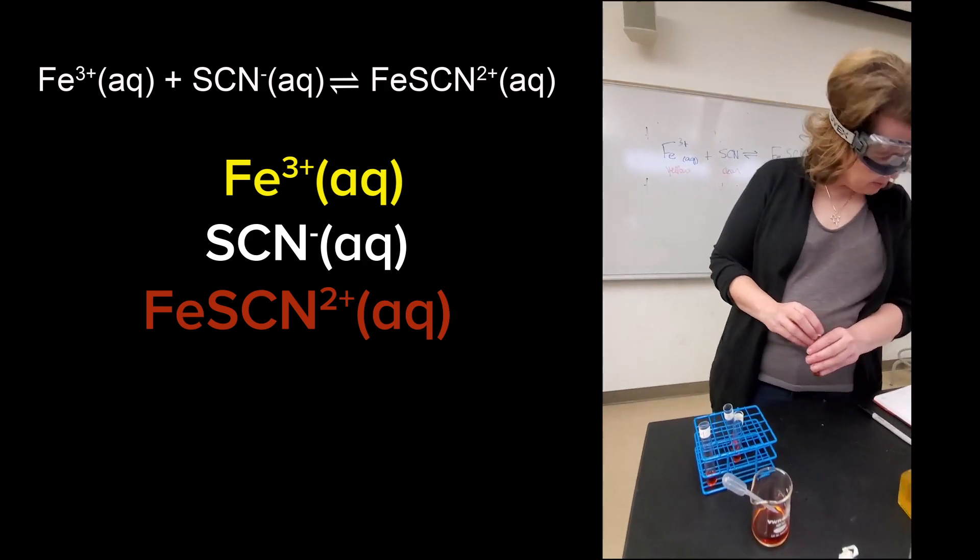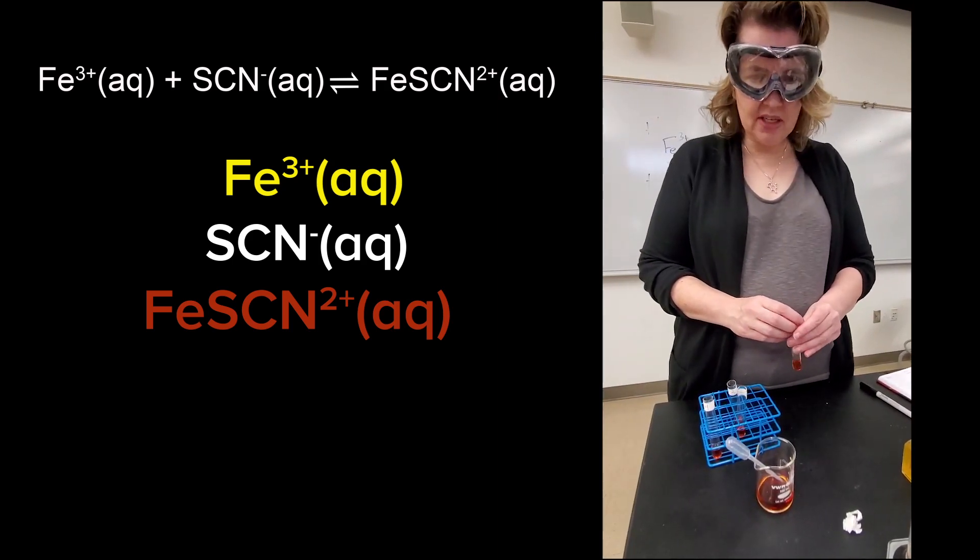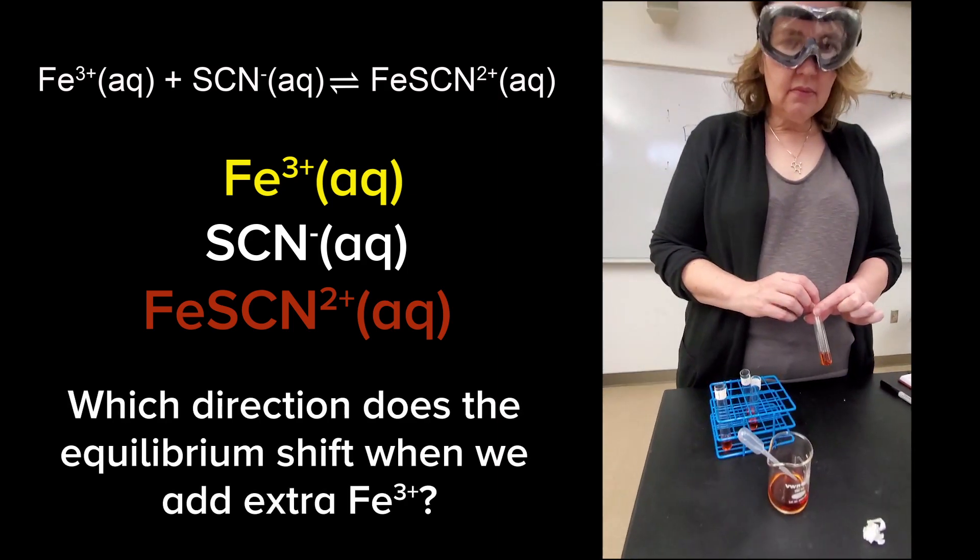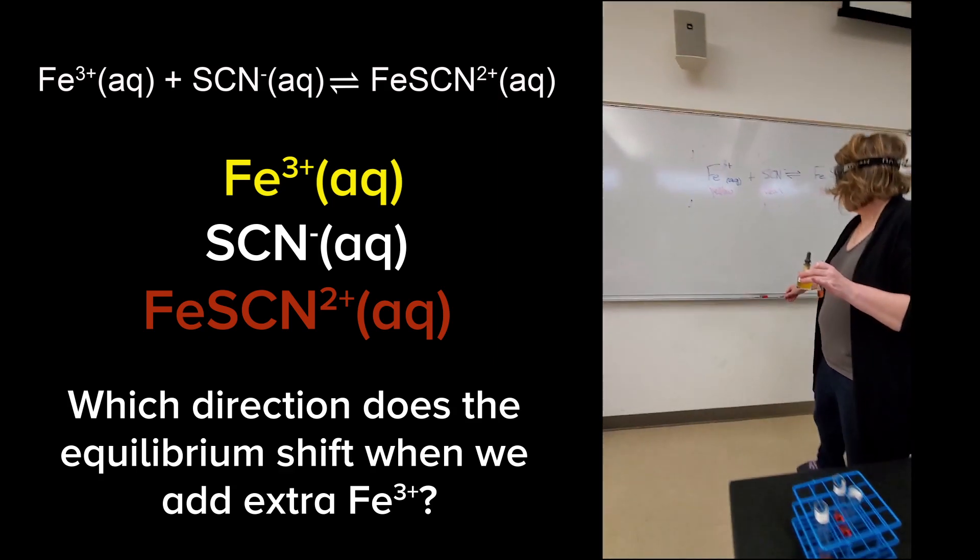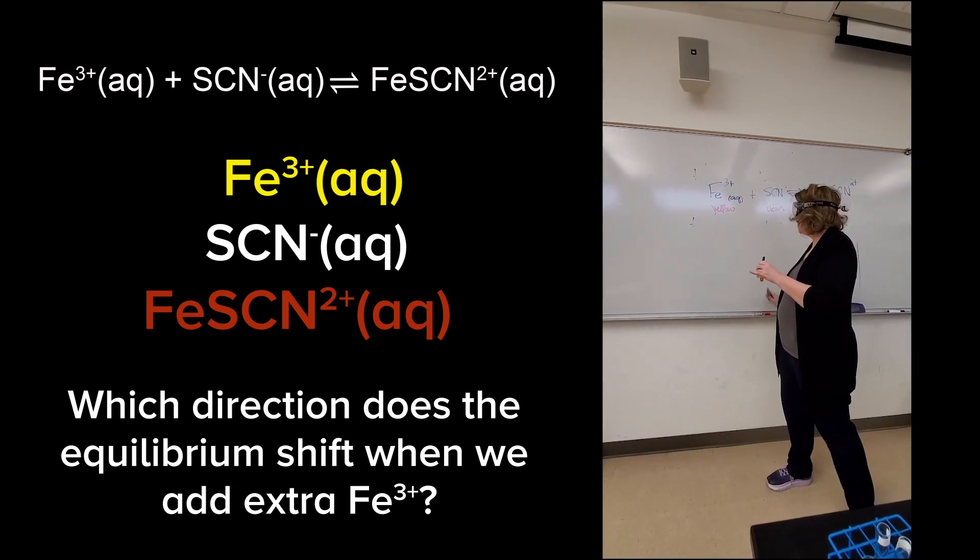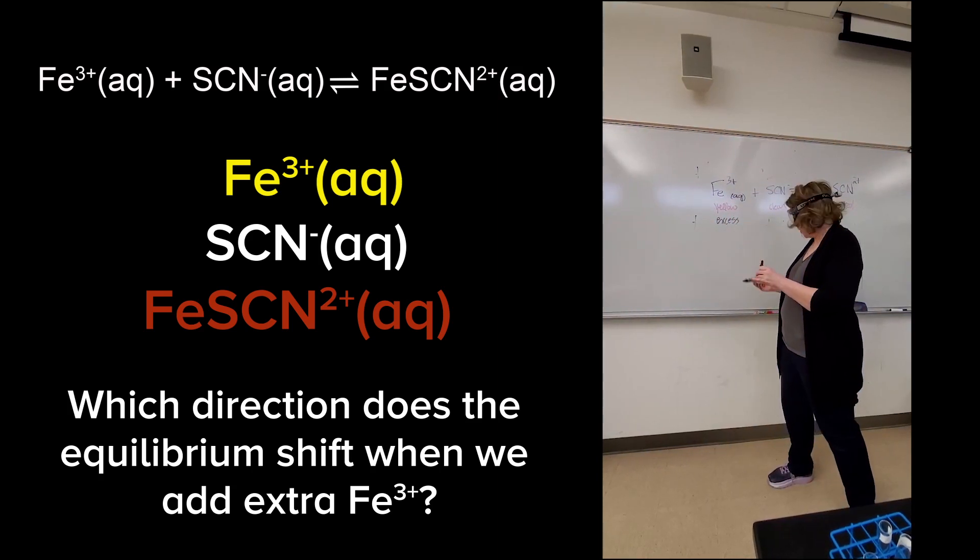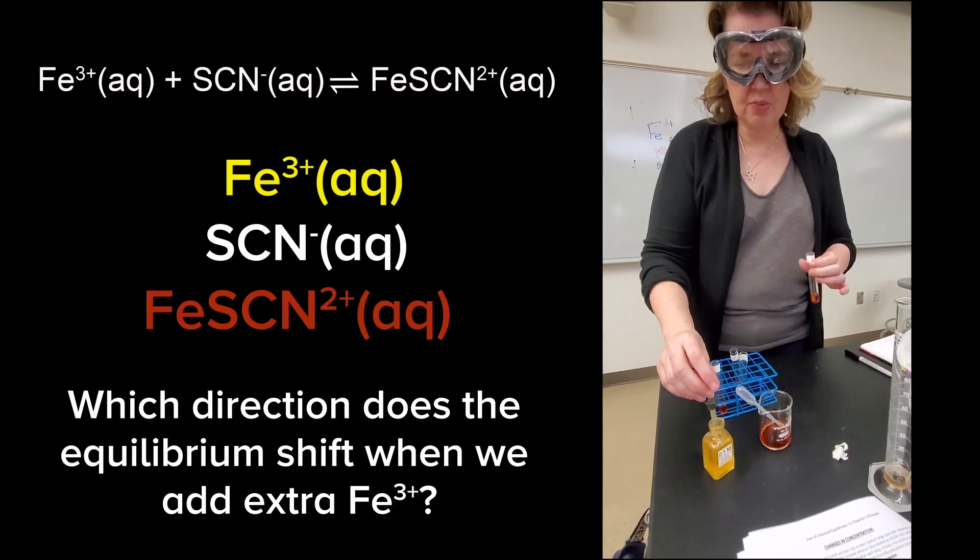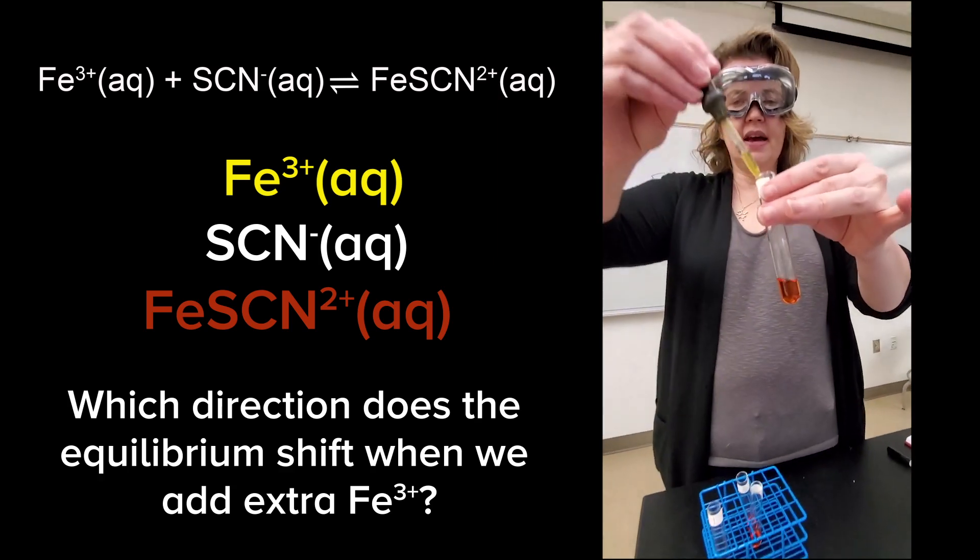Now I'm going to play with Le Chatelier's principle by adding excess of some reagent. So the first one I'm supposed to play with is which one? You want to add 10 drops of the 0.1 molar iron chloride. So that's this. So here on the board, I'm going to put an excess of this iron. So what's going to happen as I add excess? Le Chatelier's principle, take a minute and make your prediction.